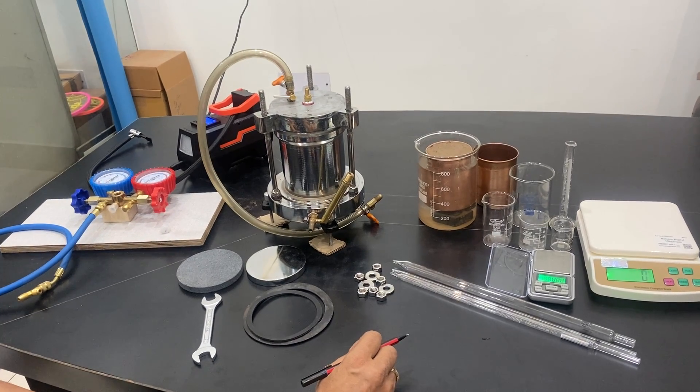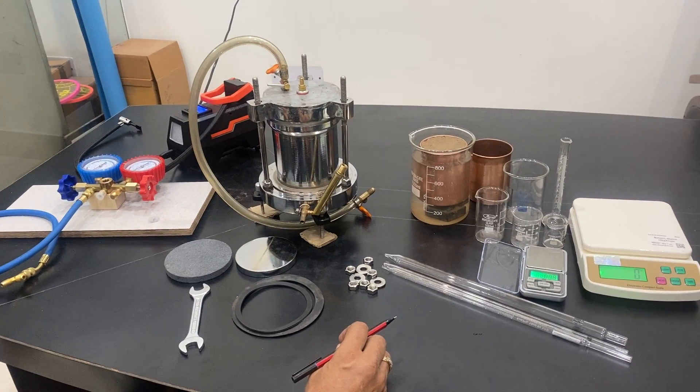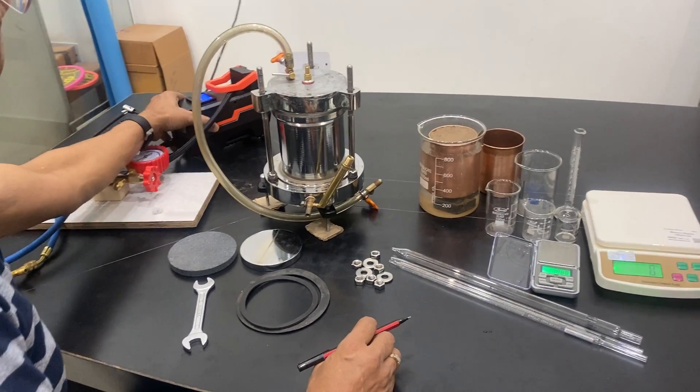Welcome to another video by Avron Experts. This is a setup to study how much water is absorbed in the soil and is pushed out due to high pressure. We have got the pressure pump.